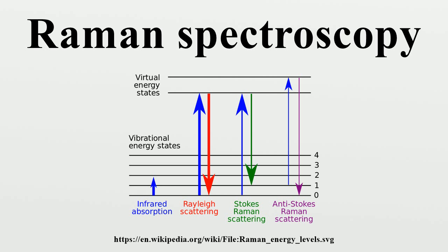sample. By using Raman microspectroscopy, in vivo time and space resolved Raman spectra of microscopic regions of samples can be measured. As a result, the fluorescence of water, media, and buffers can be removed. Consequently, in vivo time and space resolved Raman spectroscopy is suitable to examine proteins, cells and organs. Raman microscopy for biological and medical specimens generally uses near-infrared lasers. The use of these lower energy wavelengths reduces the risk of damaging the specimen.